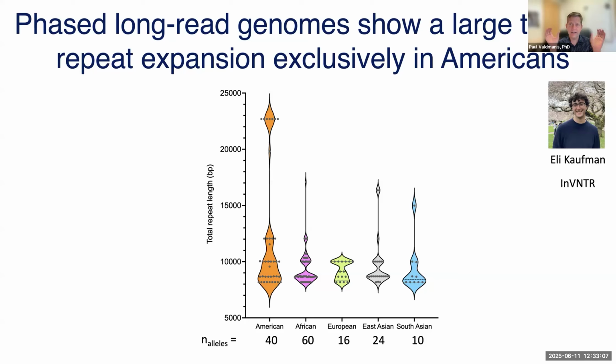From this, we can collect the phased reads from the genomic sequence reads. We can cut out sections before and after the VNTR and the VNTR sequence, and then align them into those different repeat motifs like I was showing earlier. From this program, we could see that the repeat length for MUC19 is fairly stable. Some individuals have about an 8,000 base pair repeat motif, others a 10,000 base pair repeat motif, and then in rare instances you start to see much larger segments of this VNTR.